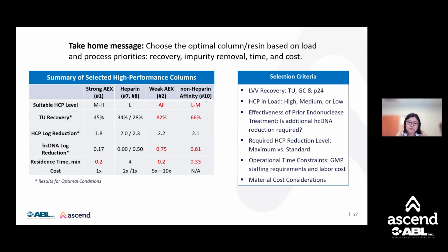And although number 2 is a lot more expensive, its impact on the overall manufacturing cost may be relatively small. As we all know, the plasmid procurement in the upstream production cost tends to dominate the process.